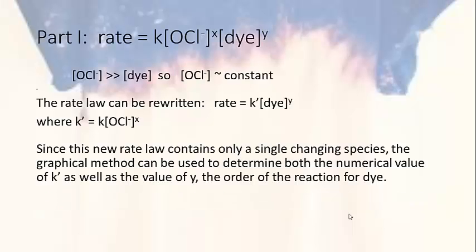The following is a link to a video that will help teach you how to make plots in Excel, and it's very important in this lab that you are able to do this because you have to make several plots for these calculations. Speaking of calculations, for part 1, our purpose here is to determine this rate law.